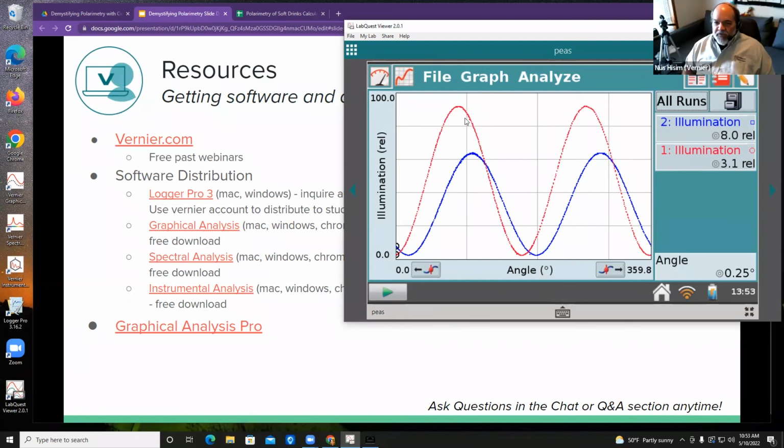I did find a couple of videos on the website of a much younger Melissa. Oh boy, doing it with Logger Pro. So the older ChemPol can be used on computers with a Labquest interface and Logger Pro.